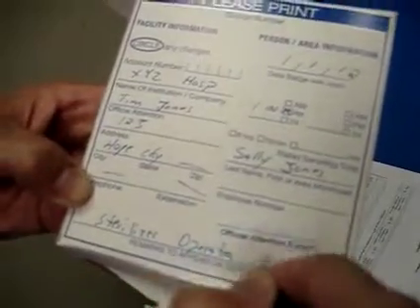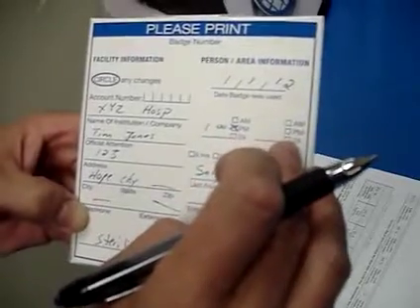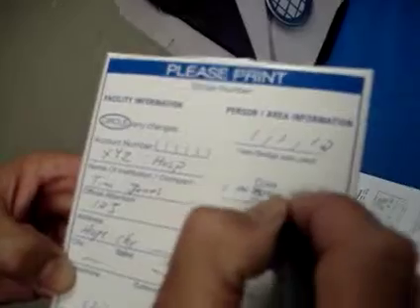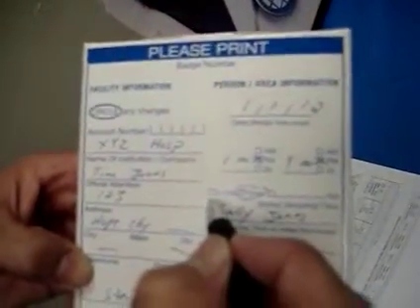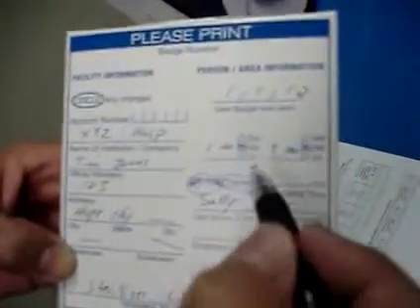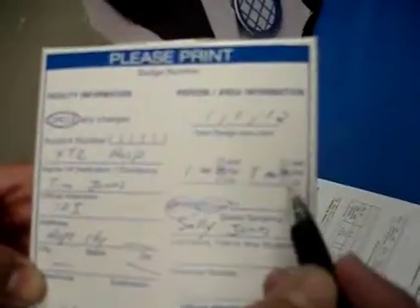And what was Sally doing? Okay, she is, let's just say, the sterilizer operator today. We're going to fill in the stop time at the end of the shift. So if Sally wore the badge until 9 p.m., then we add that there. If it's just a 15-minute badge, then you can just cross that. If it's a known 8 hours, then you can cross that. But if you're not sure the exact time of when they're going to wear it, you can put the start time and the stop time.